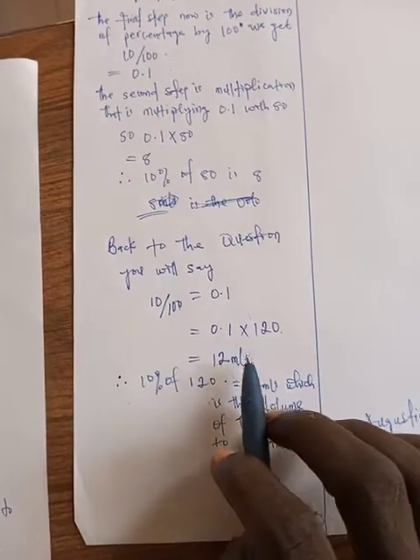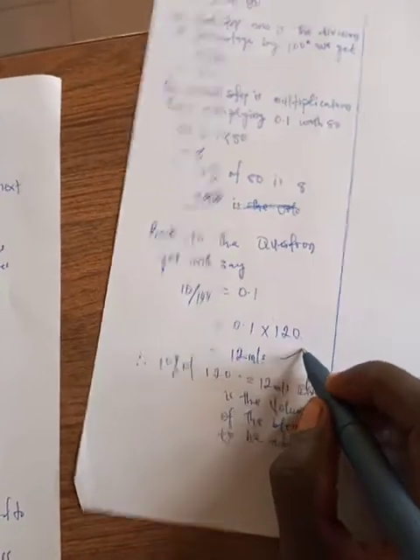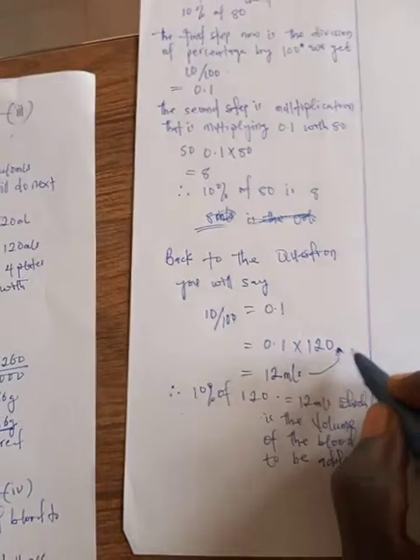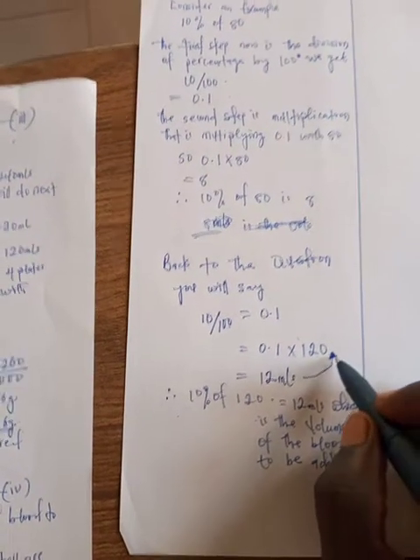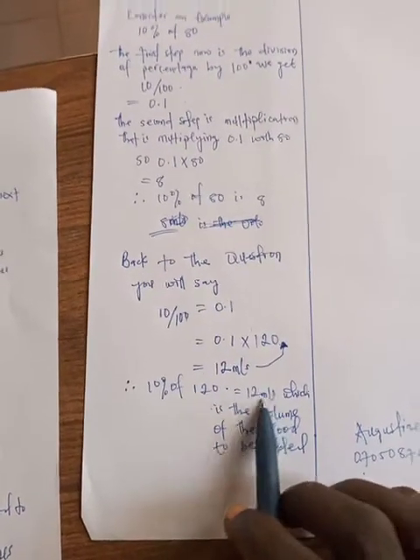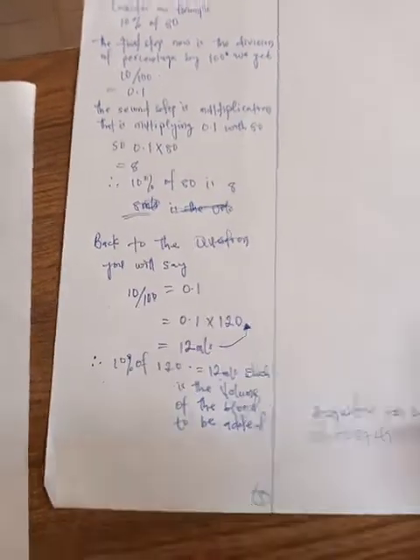So you will have 12 mils to be added to the 120 mils that was left after getting your 4 plates. So you have 12 mils of blood to be added in order to get your blood agar.